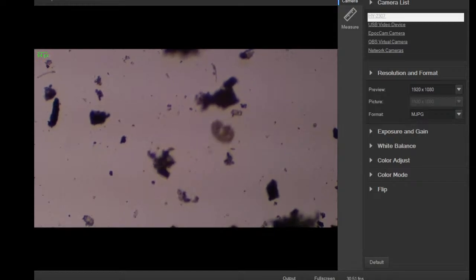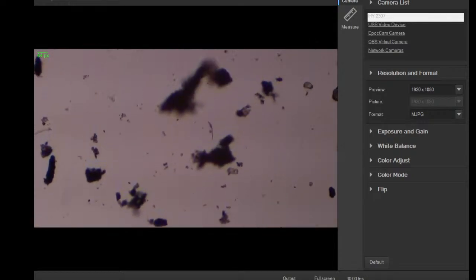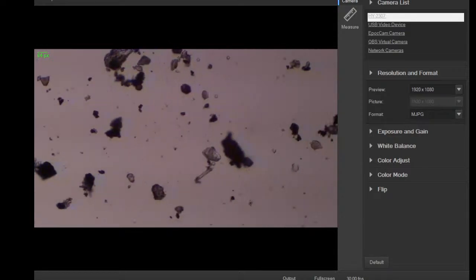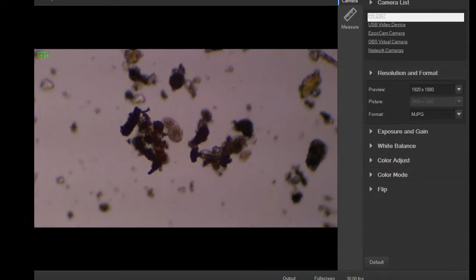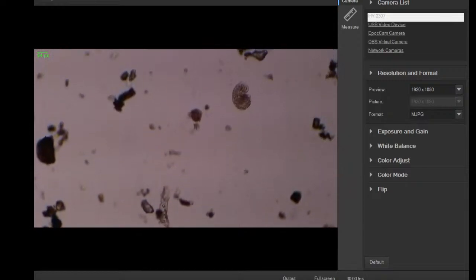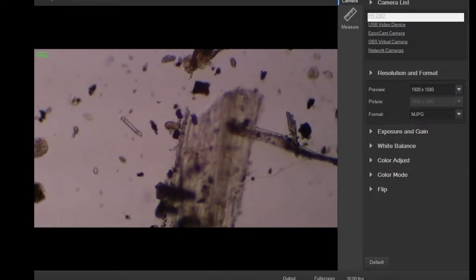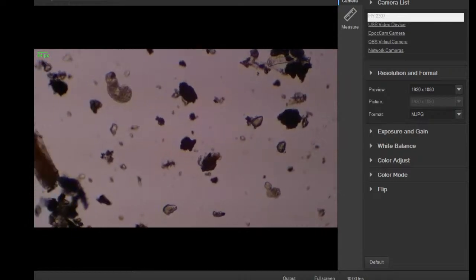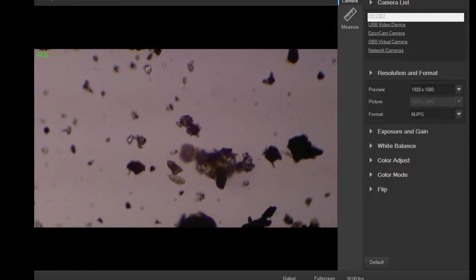Let me fix the focus. For some reason that's off a bit. There we go. Very nice. Very fast too. Yeah, I found a bunch of these in the potted plant recently. It has kind of a kidney shape to it. Occasionally they will take a break and graze on stuff, and I was able to get some really nice close-ups on one of the streams. Right now it's way too fast to zoom in too much.